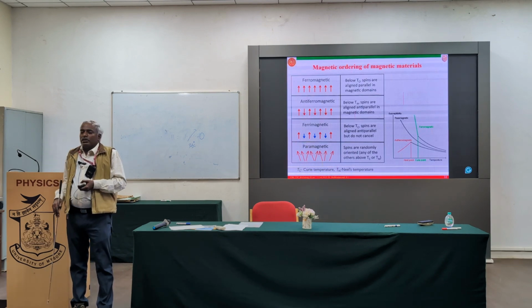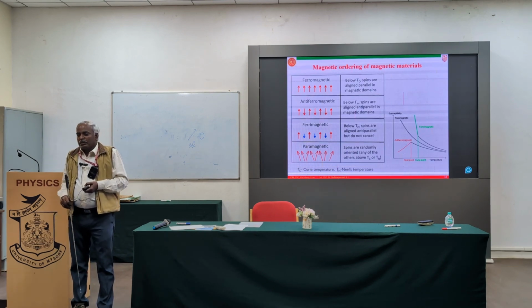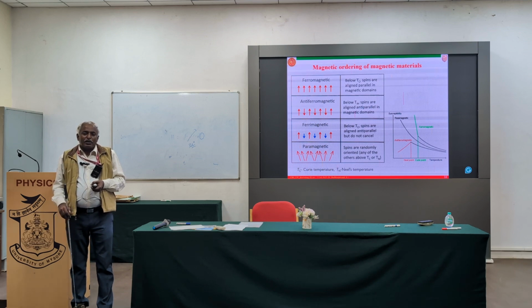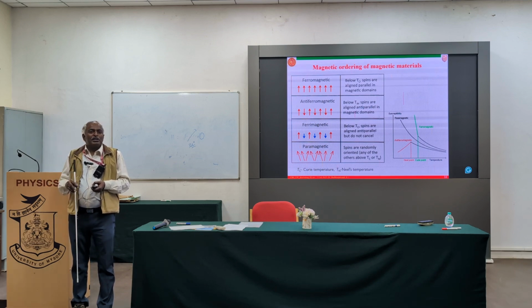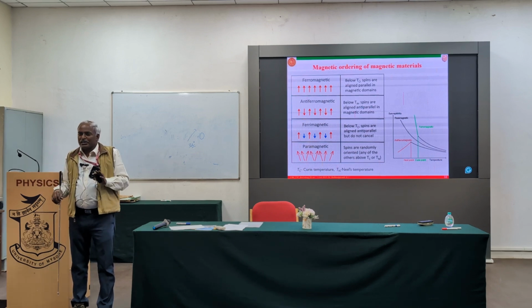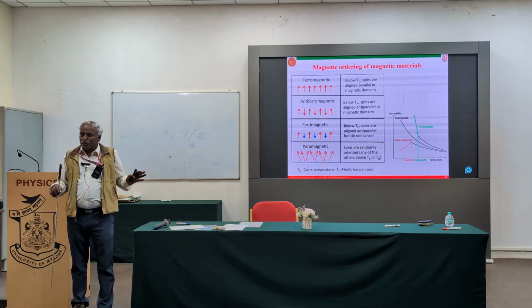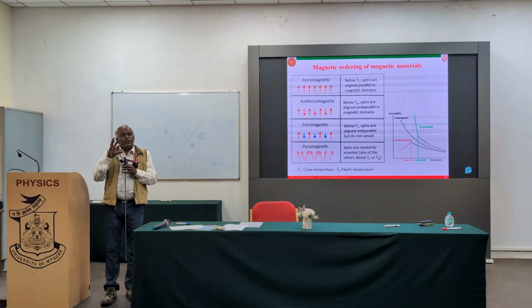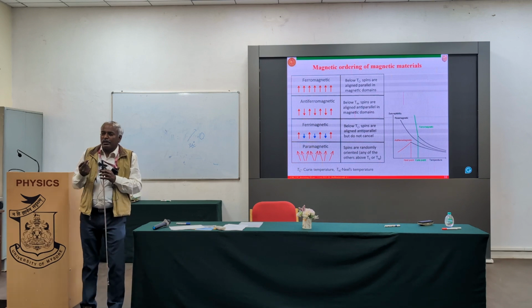Now we'll go with the next one. Since fluorine also has spin number half, your NMR, whatever you are using, generally you will be mostly using either proton NMR or carbon NMR. Whenever you go to any commercial NMR facility, they will only do those things. Since we had our own equipment, our own spectrometer, we were able to do this fluorine. And also the fun part of this one is, have you seen this Teflon tape?